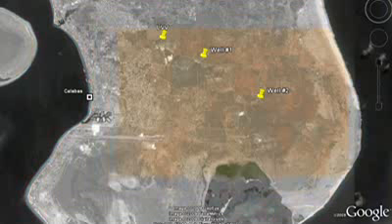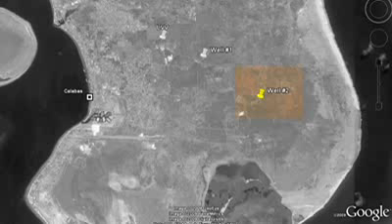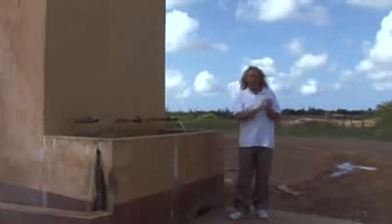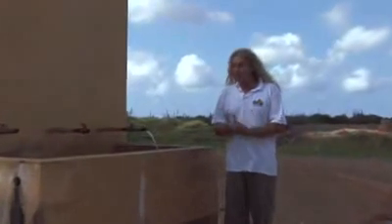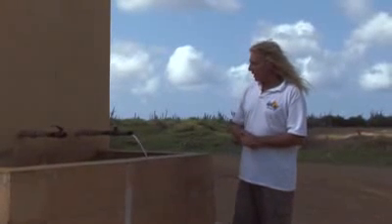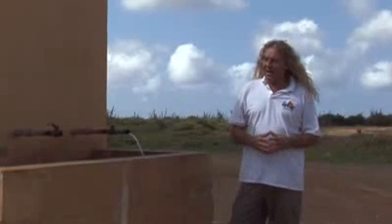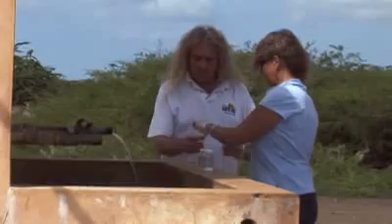We've now come out to another well. If we look east now, we're approximately 2.5 to 3 kilometres away from the ocean. The worry for us, of course, would be if that same bacteria had found its way to this particular well as well, then we would have a much more serious problem on our hands. We're hoping that we find a clear negative response from this water. But it's definitely something that has to be checked in order for us to establish how bad the contamination of the groundwater is. Dr. Peachy is now taking the coordinates of the area.